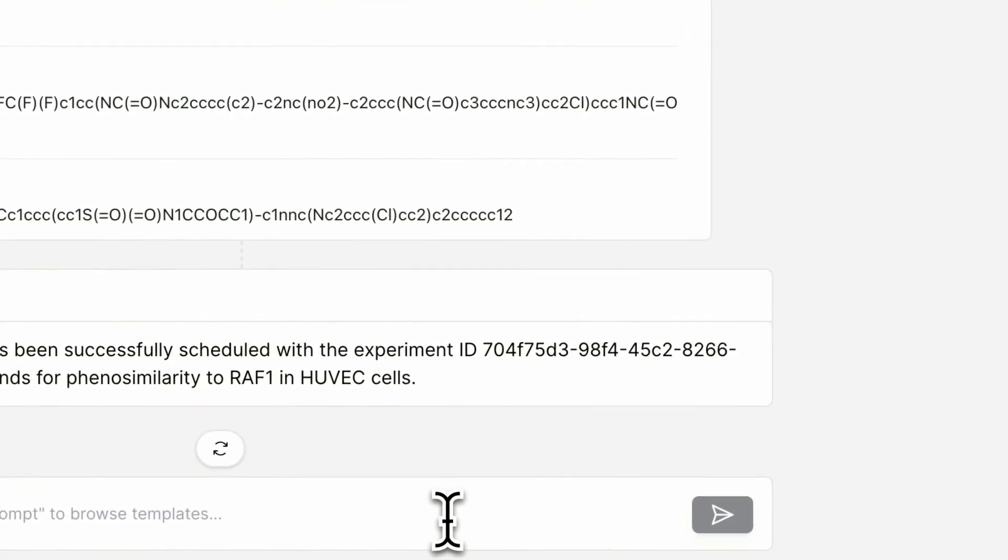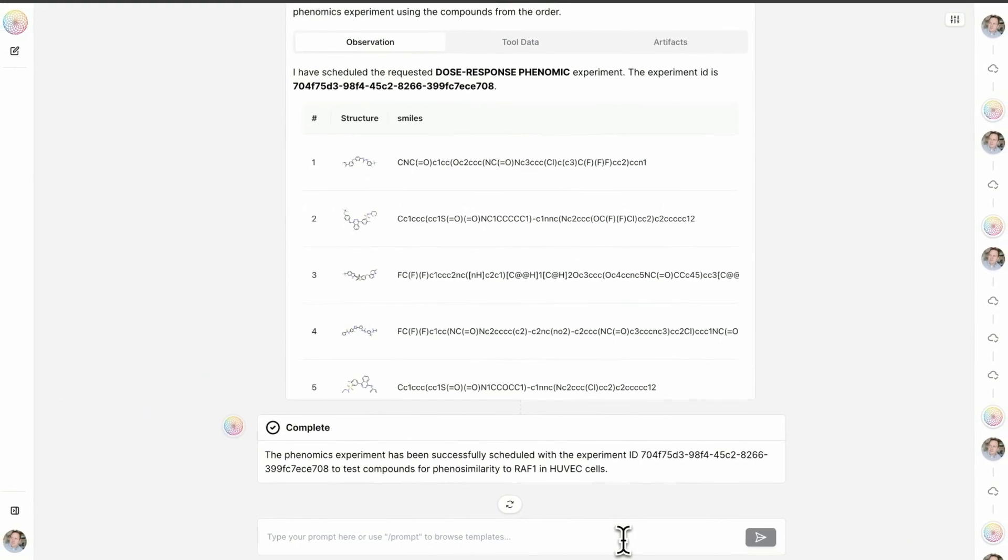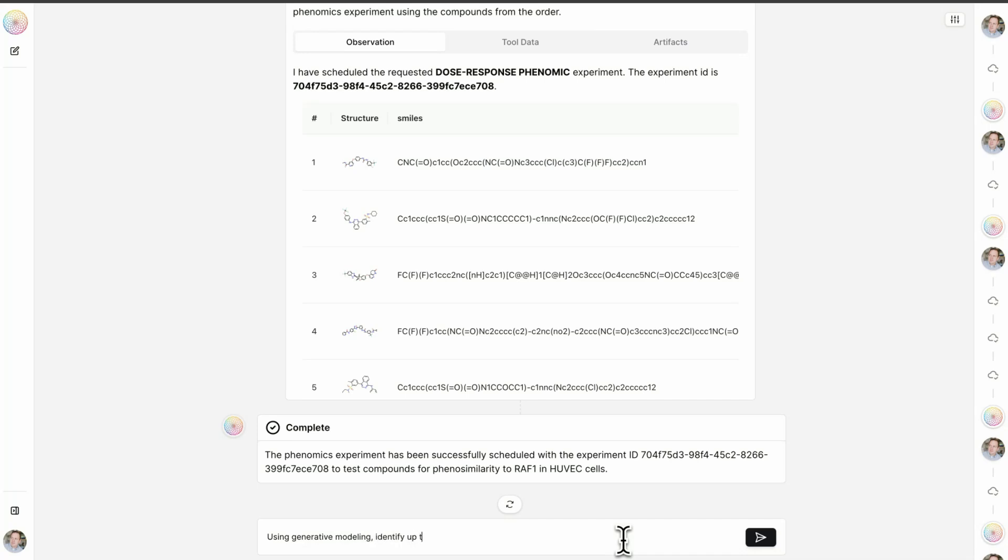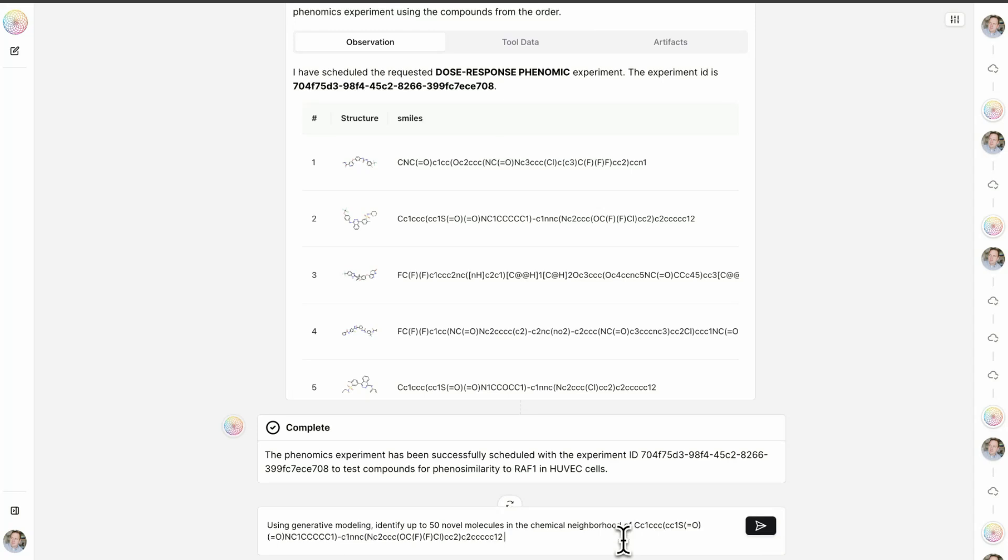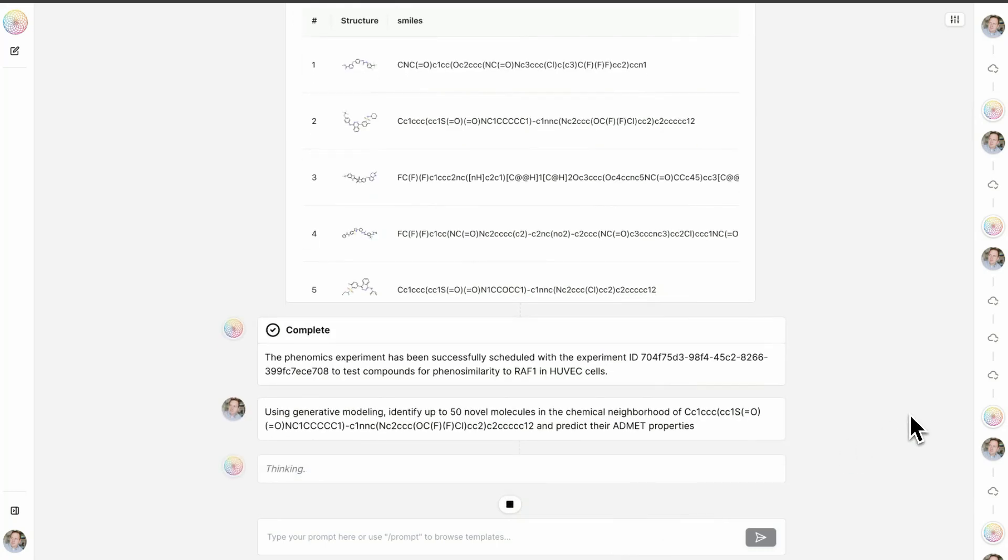Let's imagine that this molecule has the best phenomic signature in terms of mimicking RAF1. So what I'm going to do now is, using generative modeling, identify up to 50 novel molecules in the chemical neighborhood of this compound and predict their ADMET properties. So now I'm using Lowe to call a generative AI model that's been built by the team at Valence Labs to expand the chemical space around this early hit.